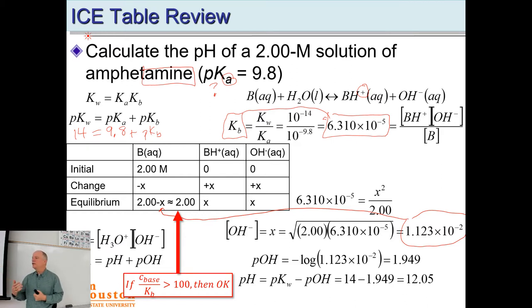And so it could be dramatically different. There could be a different species in the bottle. Like we have on our concentrated ammonium hydroxide, or sometimes it just says aqueous ammonia. Okay, so which is it? Is it ammonia or ammonium hydroxide? Well, at equilibrium, you'll see that it's ammonium hydroxide, but the bottle may be labeled ammonia. And so that's the nominal concentration, or what we call C.